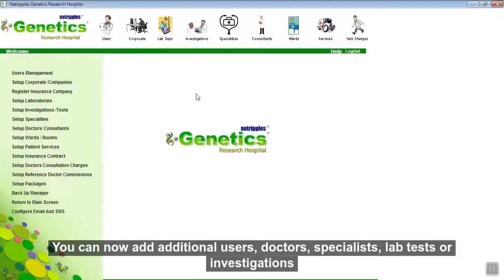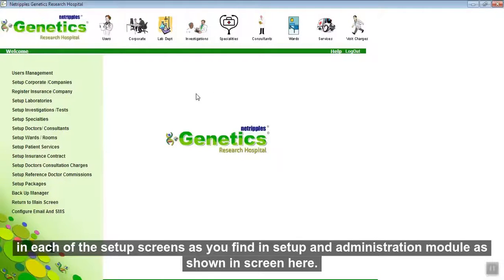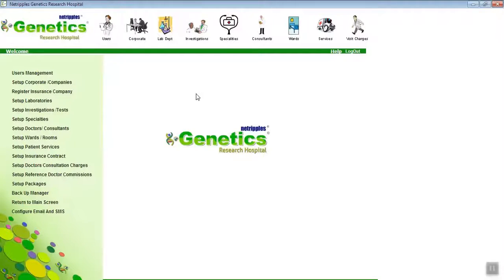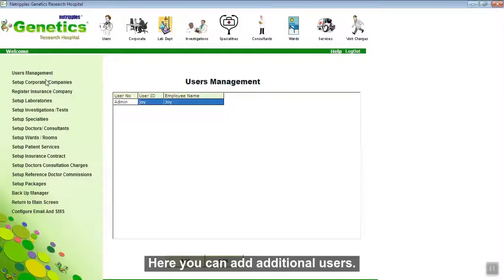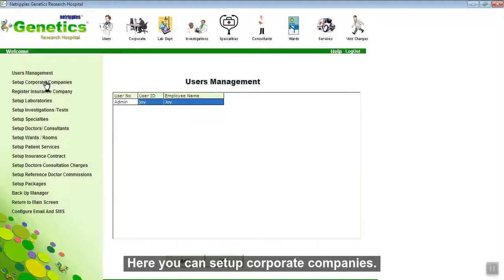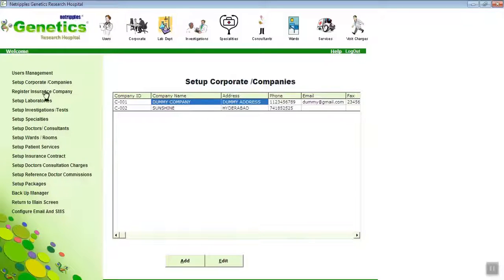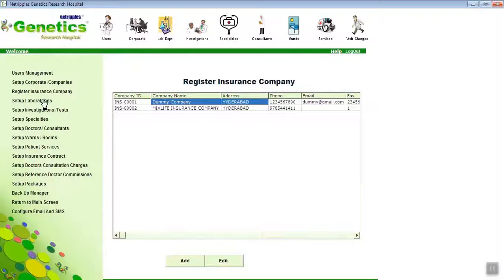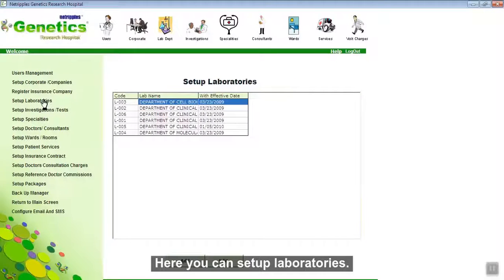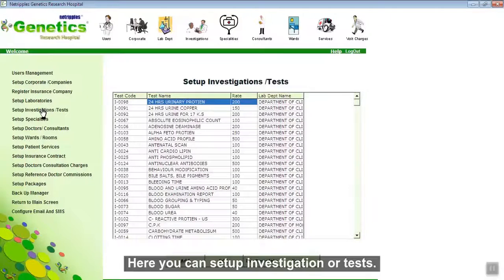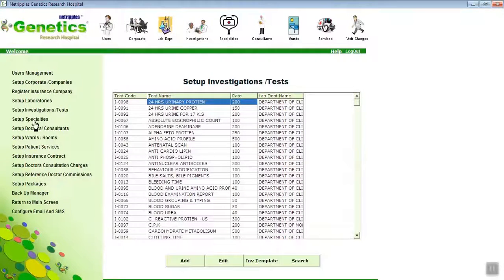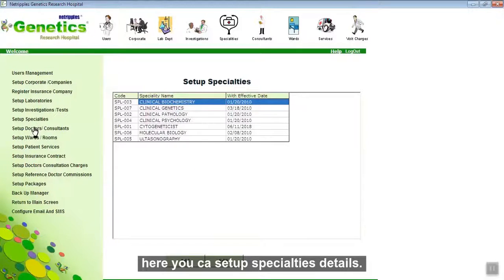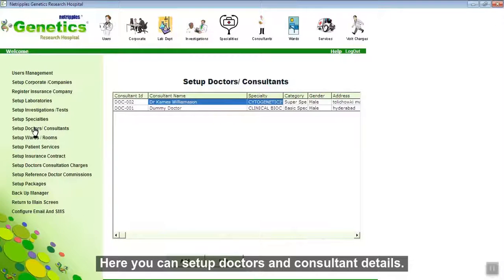You can now add additional users, doctors, specialties, and lab tests or investigations in each of the setup screens found in the Setup and Administration modules. Here you can add additional users. Here you can set up corporate companies. Here you can register insurance companies. Here you can set up laboratories. Here you can set up investigations or tests. Here you can set up speciality details. Here you can set up doctor or consultant details.